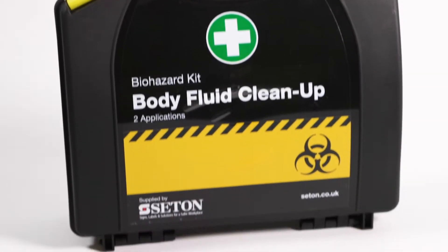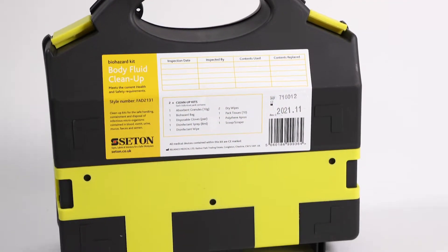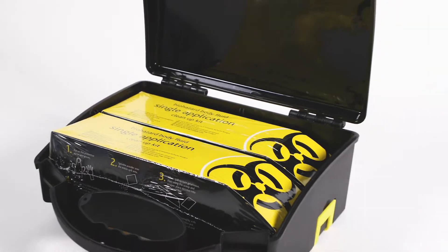Two application body fluid spill kit. An integral bracket holds the kit flush to a wall. The carry case is waterproof, dustproof, and sturdy.